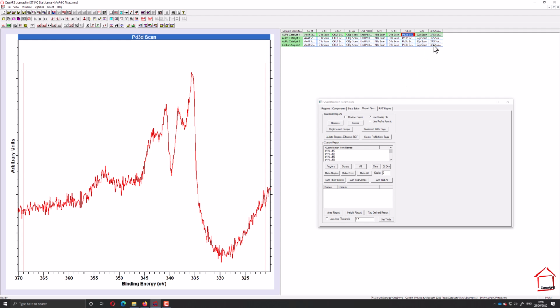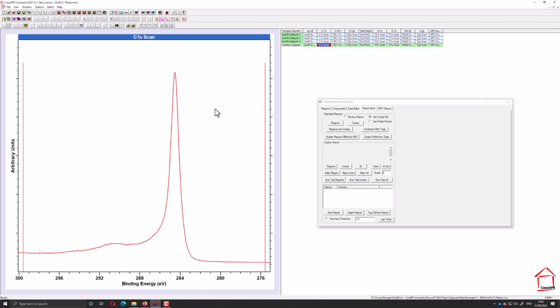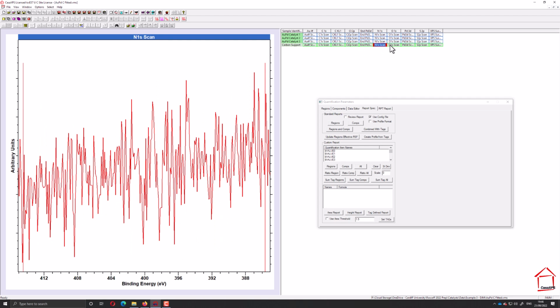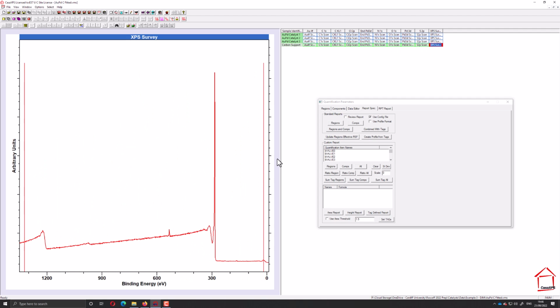And we can kind of see this if we just go to the carbon support itself. So you can see there's no gold in this. There's our carbon, no chlorine. We'll ignore that palladium for the moment. No nitrogen, some oxygen, some sulfur, and we can see again from the survey there's just a little bit of sulfur, our carbon and our oxygen.